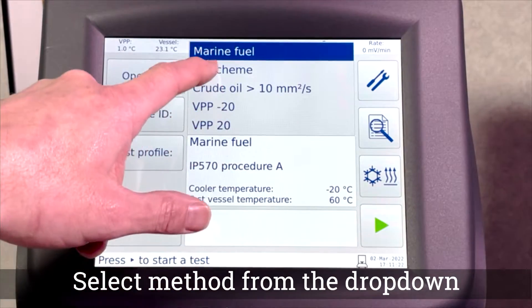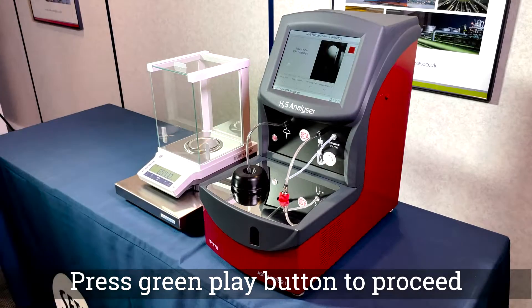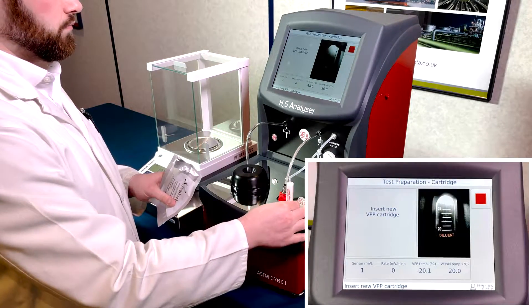Select a desired test profile or method for the sample being run. Press the green play button to proceed and follow the on-screen instructions.